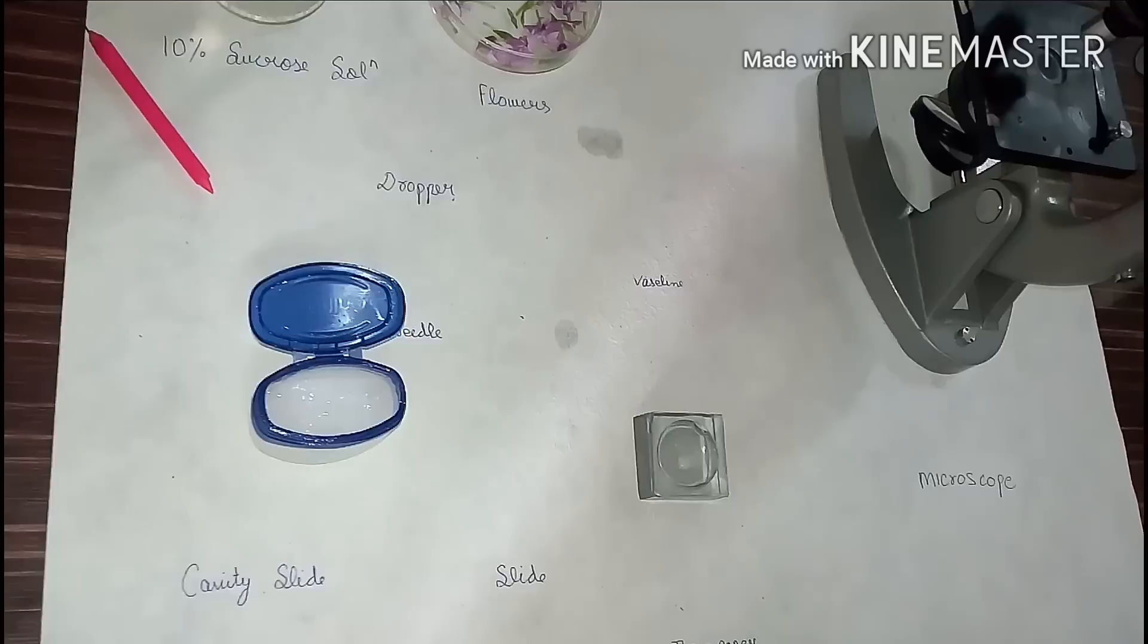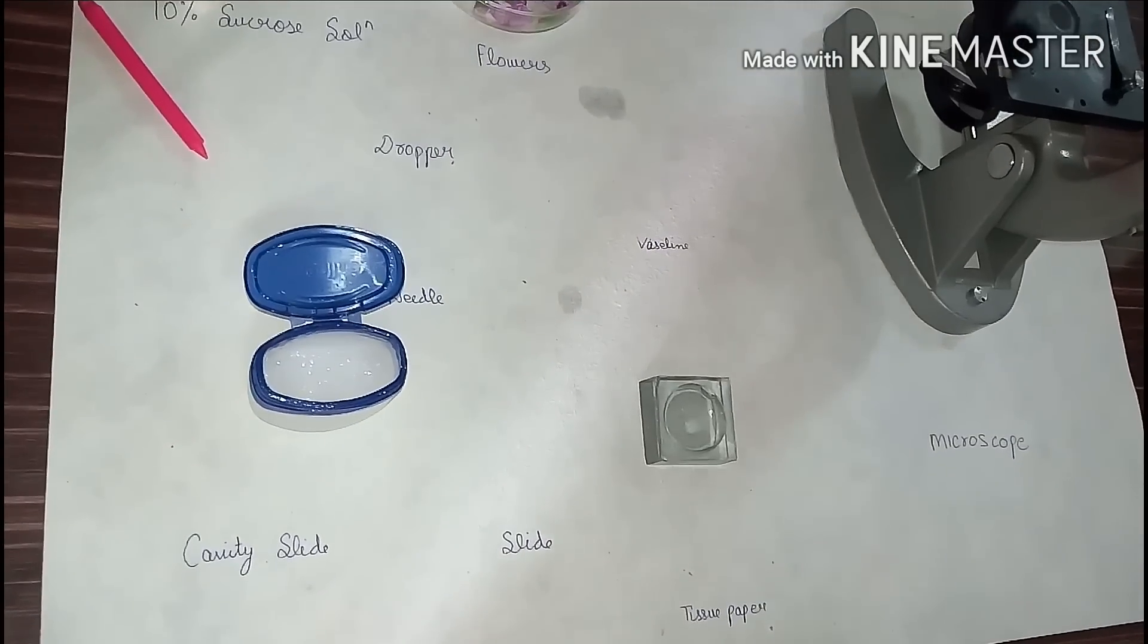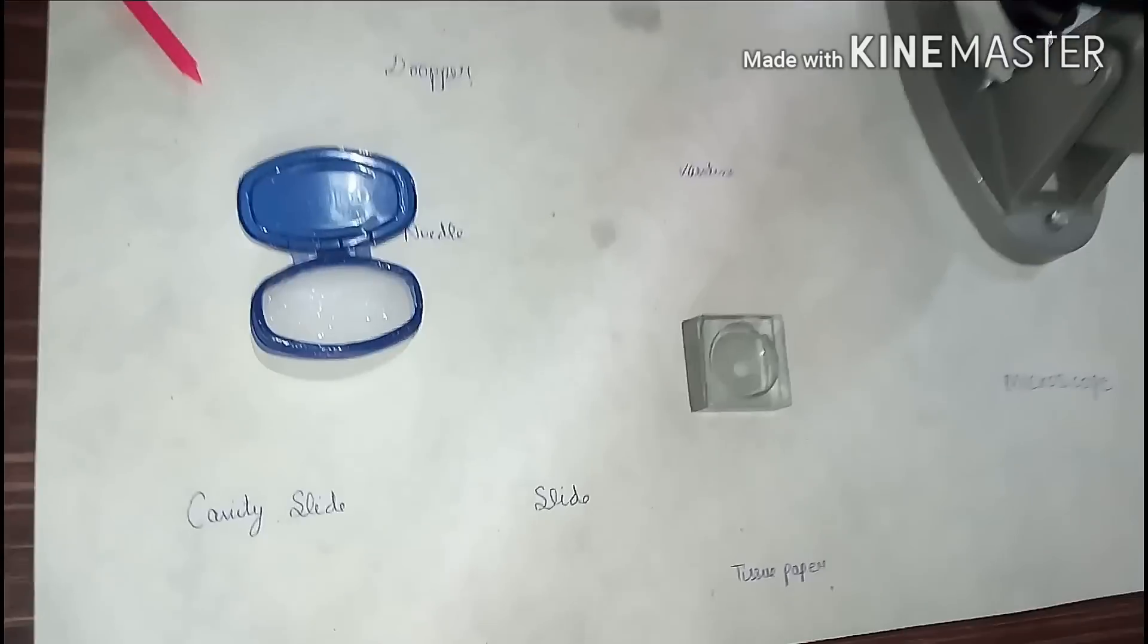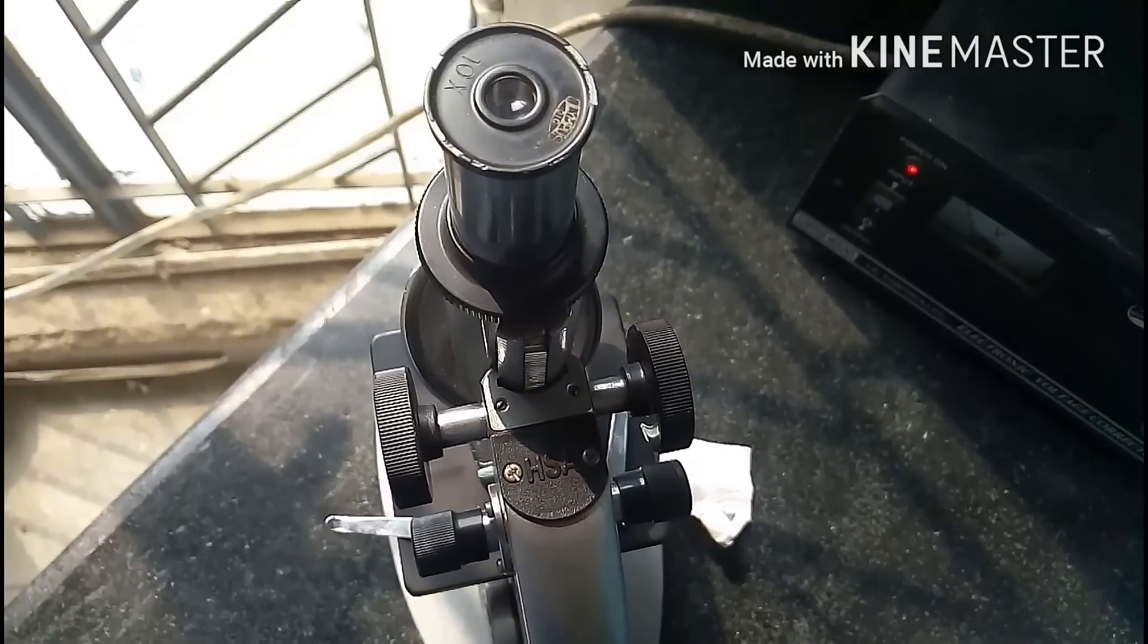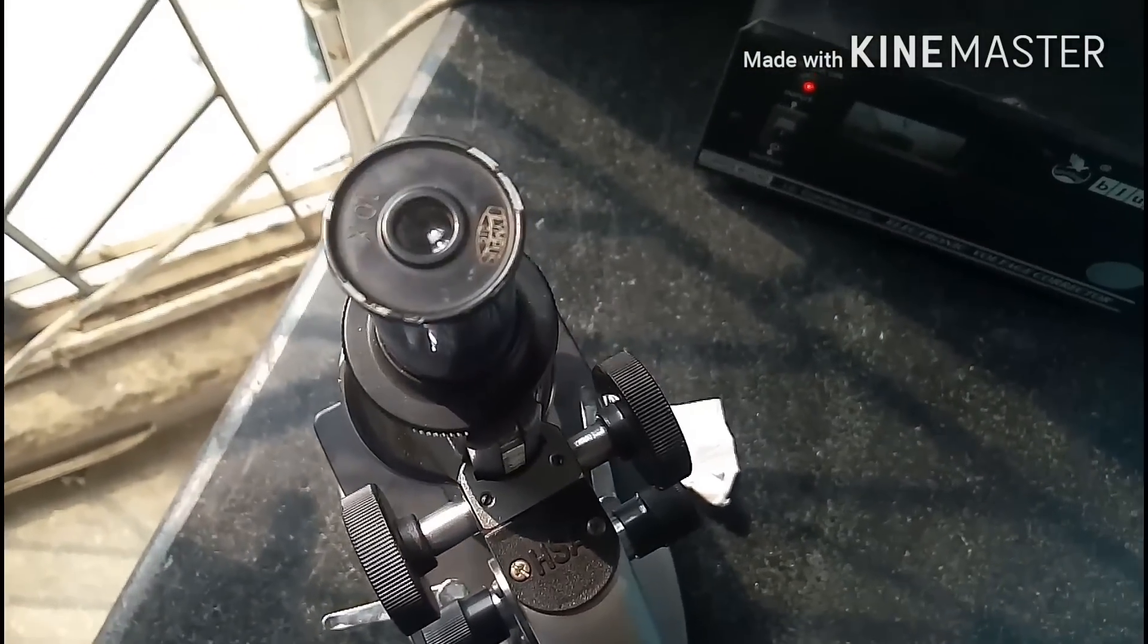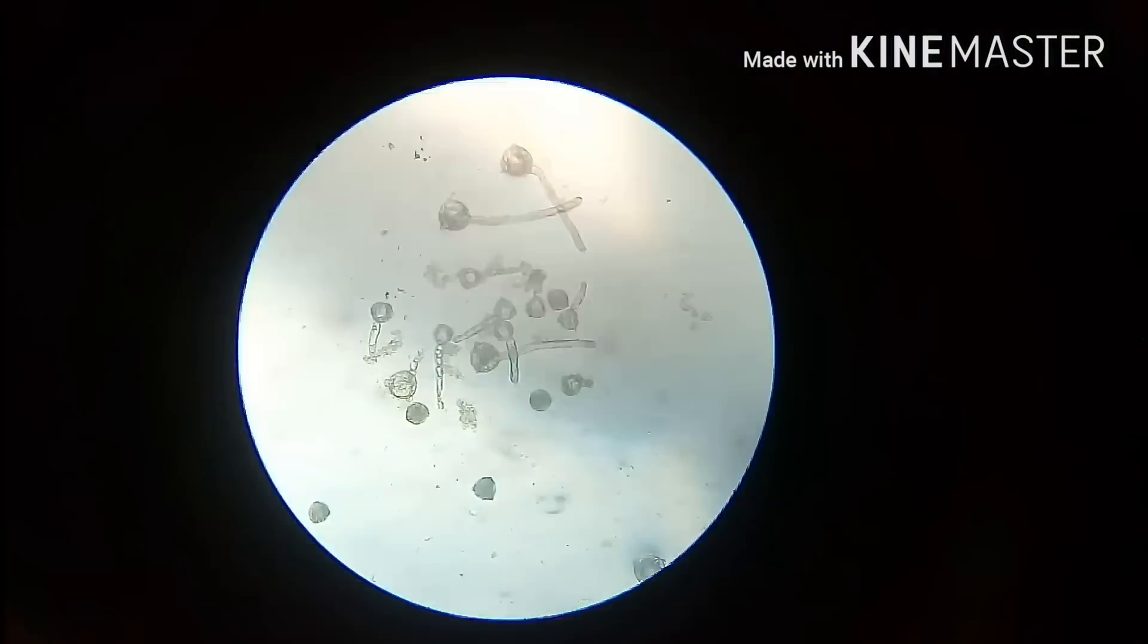Now wait for 10 to 15 minutes or maybe longer for the germination. So it's been 15 minutes from our last step. Let's check how is our germination. See this, lots of germinated pollen grains.